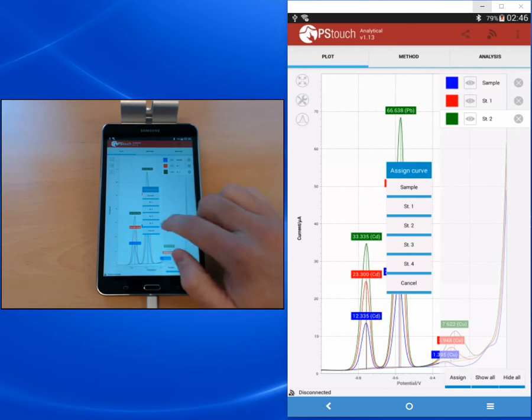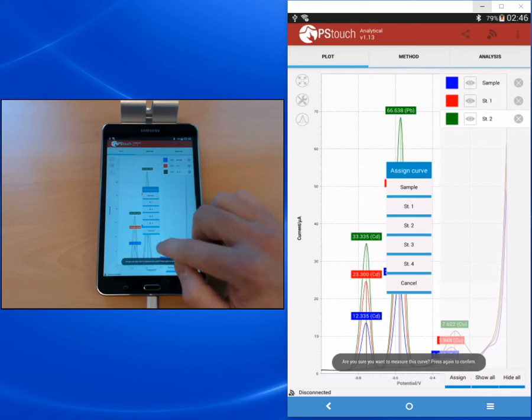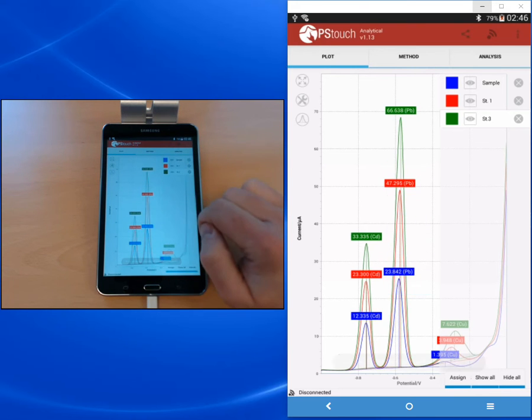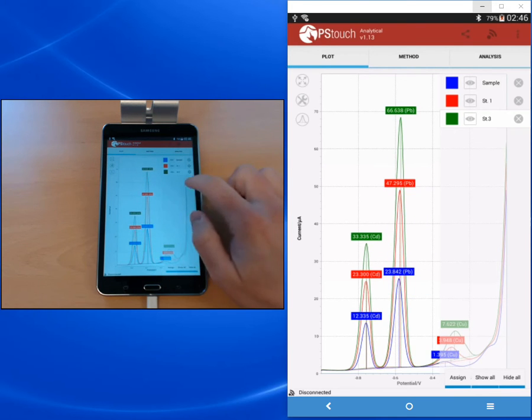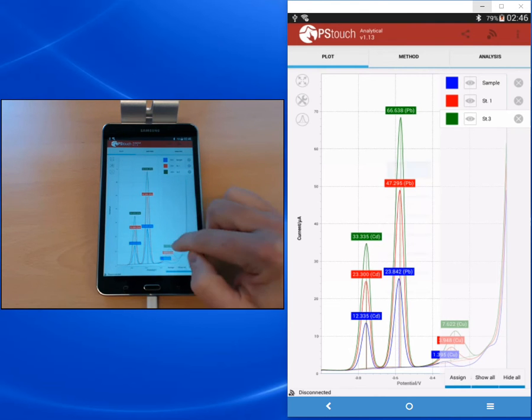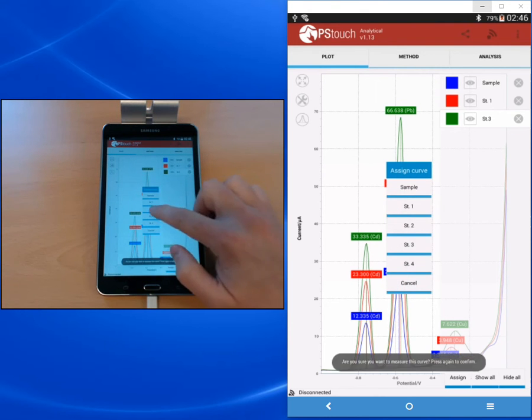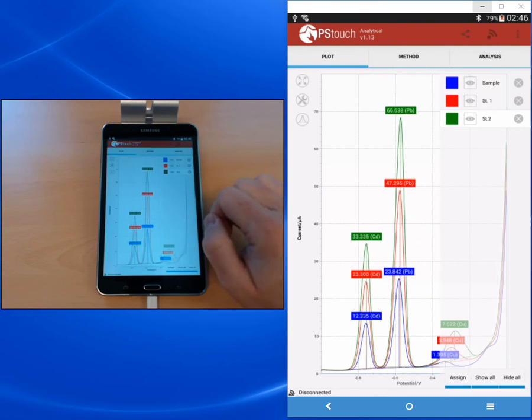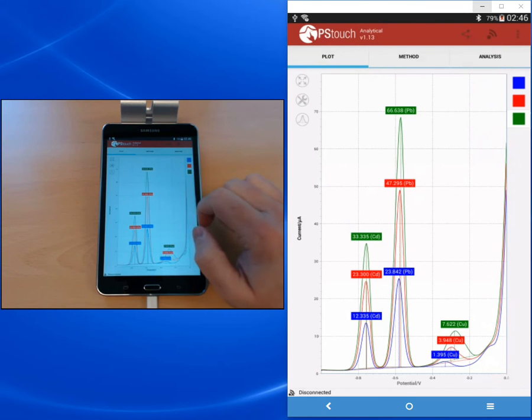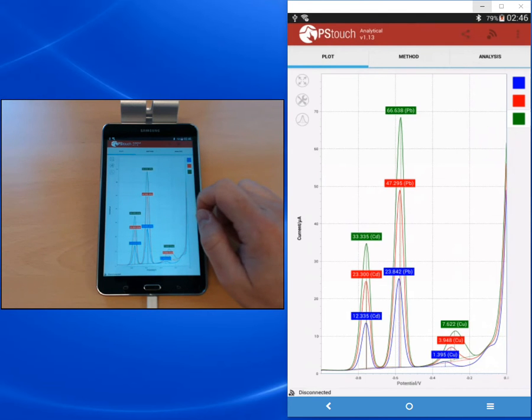When we change the curve assignment we're asked to confirm. So I now change this curve to standard three, and if I want to change it back to standard two I have to press twice and that's it.